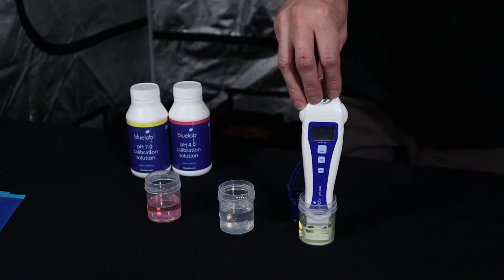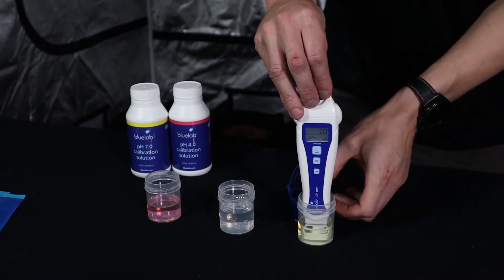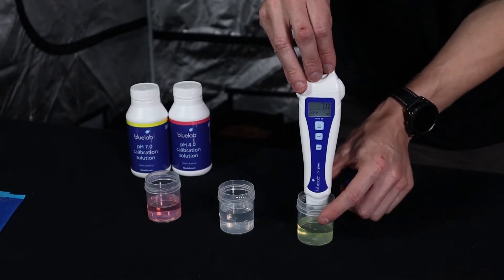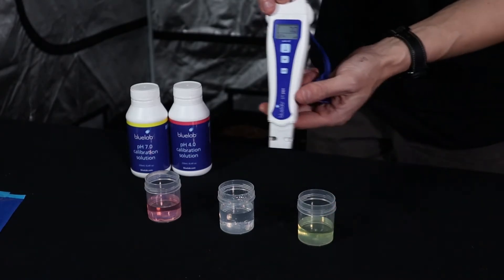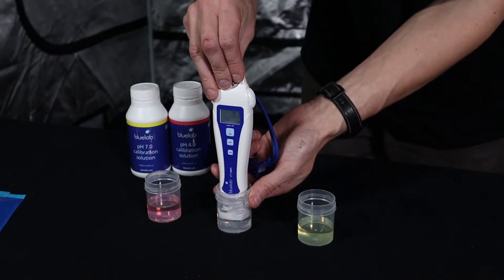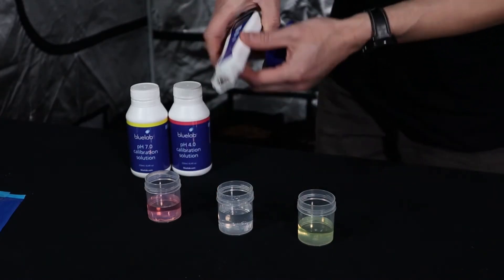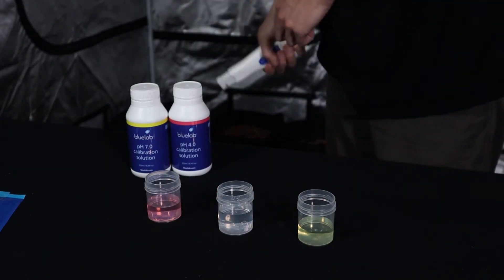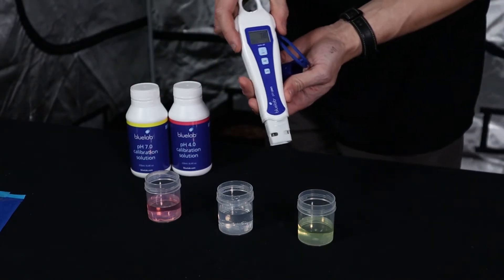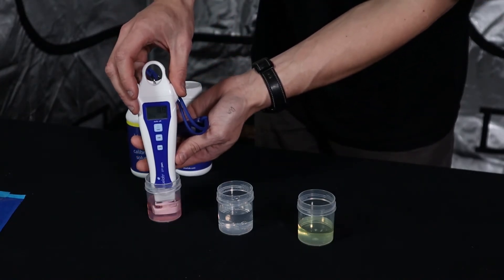If you run into any problems it will display 'ER' for error — there are a number of things that can cause that, and there is a troubleshooting guide if it occurs. After calibrating at PH7, take the pen out and rinse it off. We don't want to contaminate the PH4 solution, so wipe and rinse off the excess. Don't completely dry out the sensor, but avoid cross-contamination. Then move over to the PH4 solution.